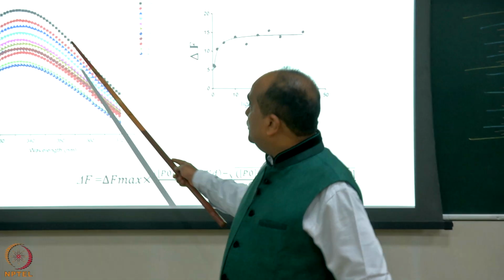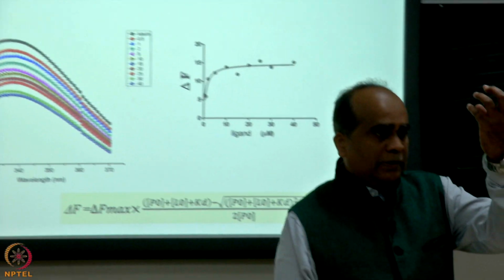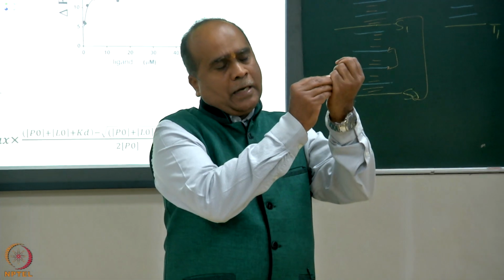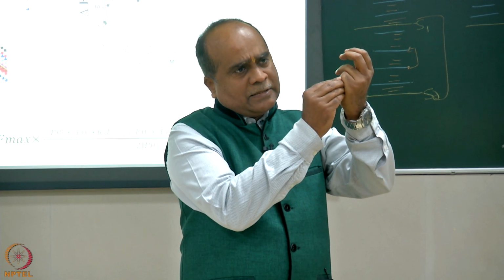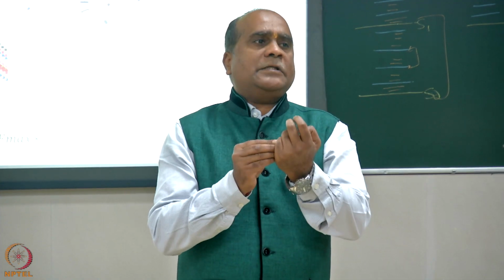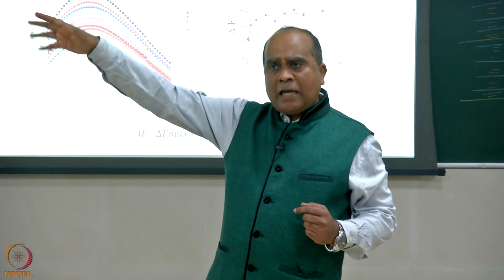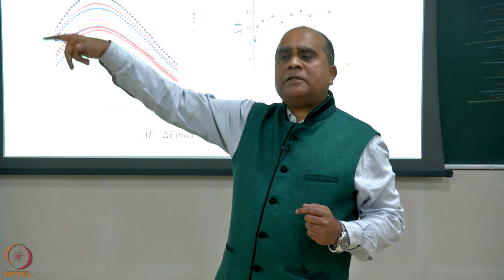So, here the fluorophore is an intrinsic fluorophore, which is inside the protein, right. The fluorophore, suppose tryptophan, is there, but what is happening when you put the drug? Suppose this is my tubulin and here my drug is coming and binding. For binding, something is changing near the tryptophan, and that change is decreasing the fluorescence, because the protein does not remain the same when the drug binds. That change we are monitoring, whether it is binding to the protein or not.